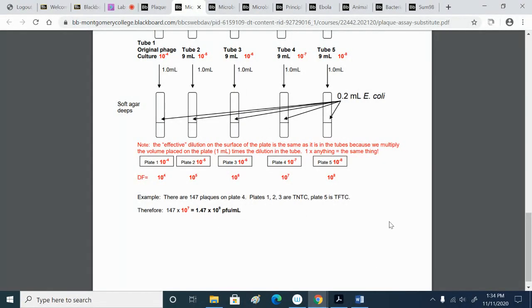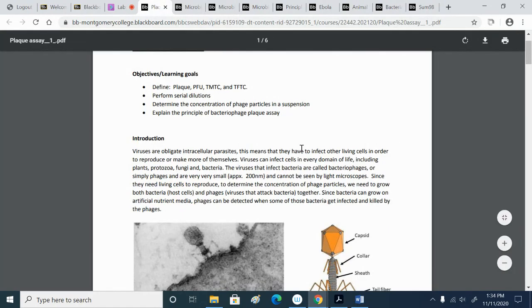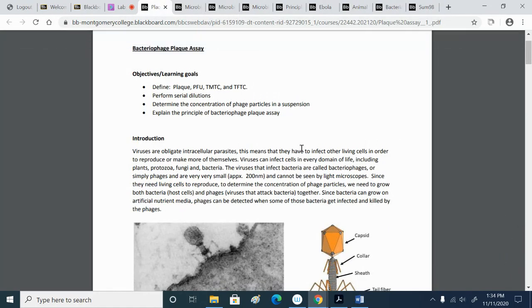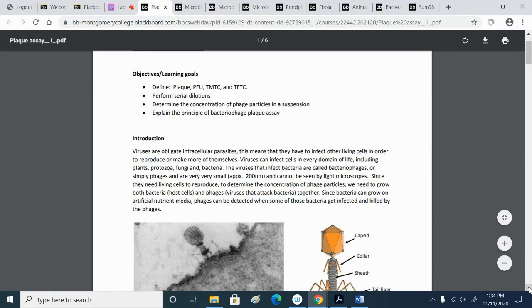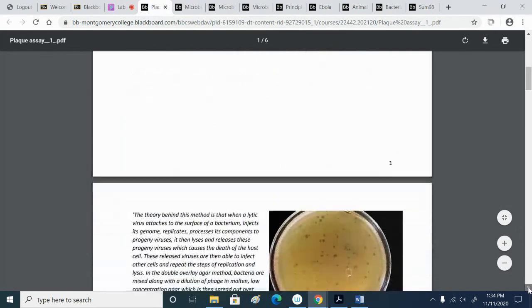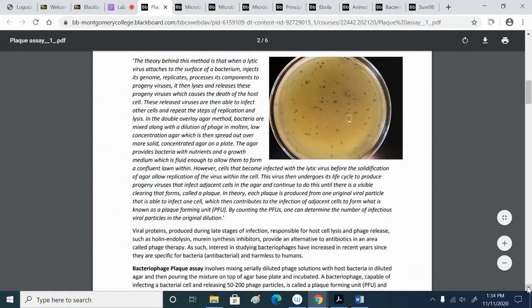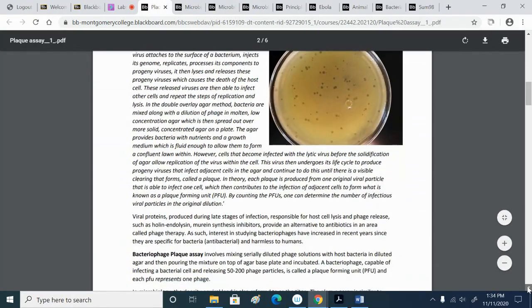And so let's look at the other handout, which has a lot more background information, a lot of which we already know because we know about bacteriophages. You know the 5 stages of replication. And so again, we have our phage plates, lots of E. coli, or whatever the bacteria are growing on here, and then the holes in the growth, which are the plaques. And of course, if you see plaques, that means the virus is following the lytic life cycle.